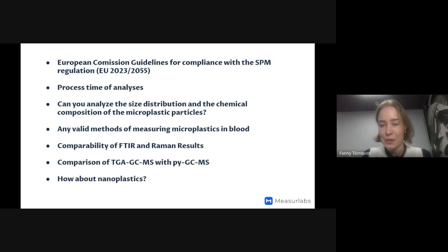Then we have a very interesting question from Kimani asking what the main challenges are that we are currently facing with the current microplastics certified reference materials on the market?